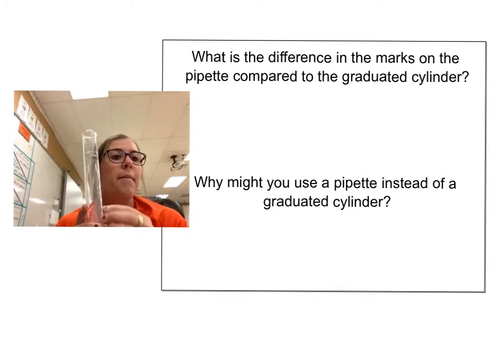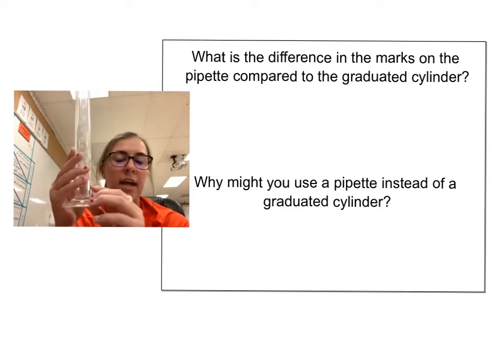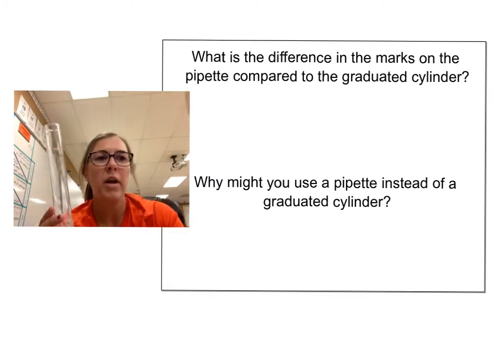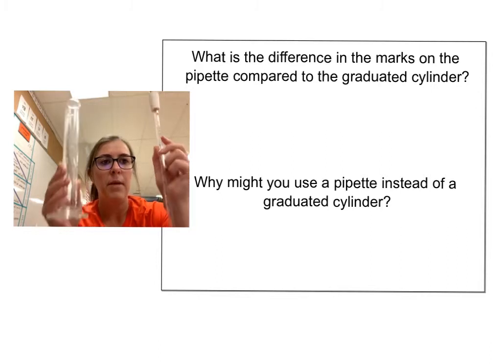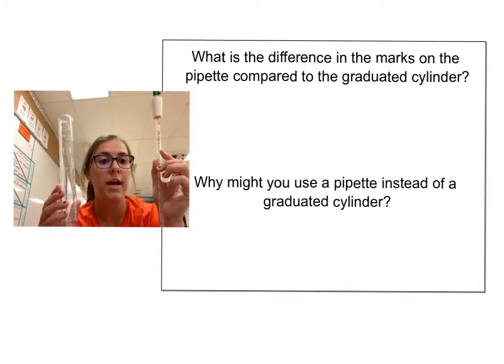Okay, I'm talking about the markings here. So again, less about that I'm asking for 10 and this guy starts at 10. I'm saying, why might I use this even if I needed 20? Why would this be better to use versus this guy based off the markings? Write those answers, what you think, in your notes as a prediction.